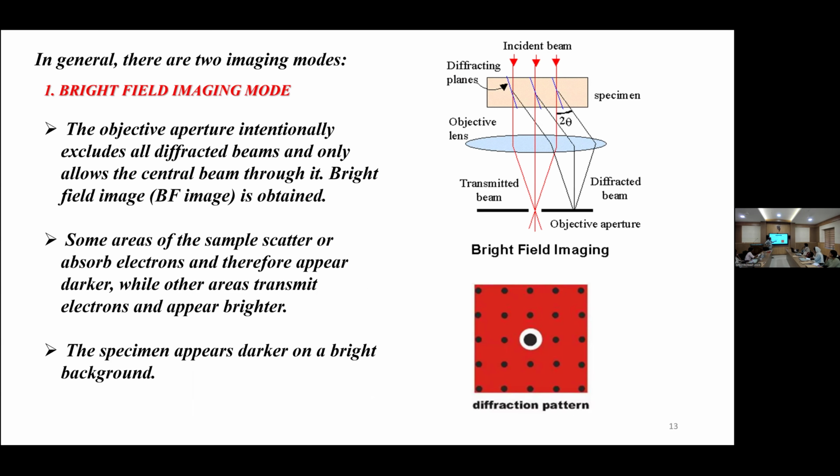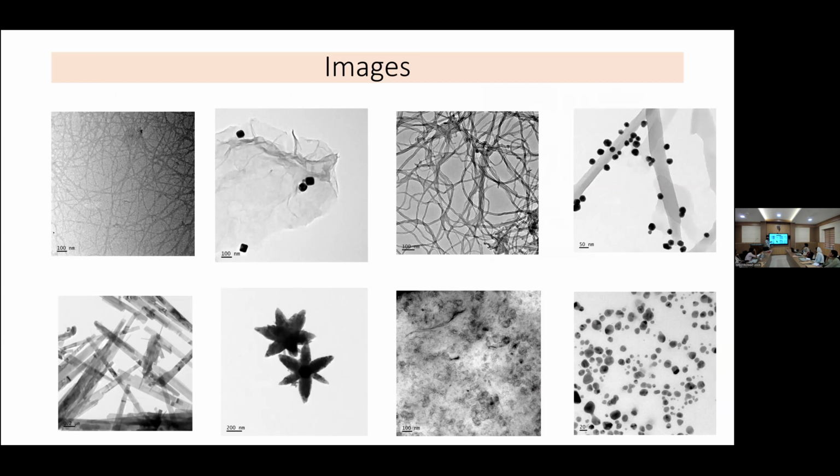We are using that information for high resolution imaging also, because those scattered electrons carry our lattice fringes information. So we are using this transmitted as well as diffracted beam and taking our FFT to create the crystal plane images. So we will directly get the lattice fringes images. And these are some of the images we will get in imaging mode. We place the sample and then just project, and we get this kind of shadow images.